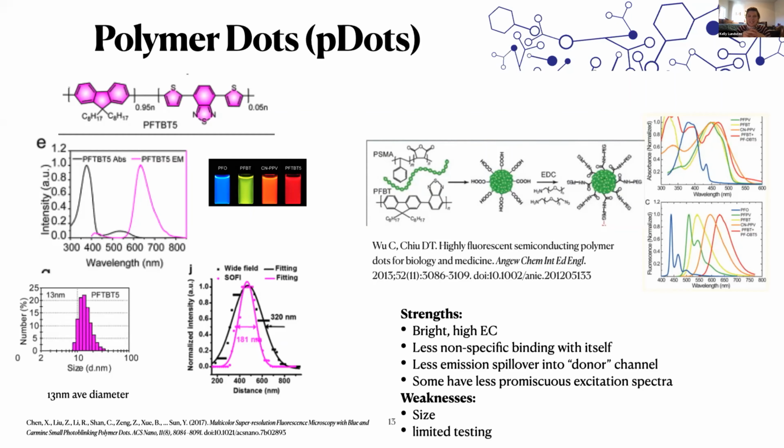But again, the weakness is going to be size. And right now it's just a limitation of testing. I would imagine they've got to be a little sticky. I don't know that for sure. I imagine they're going to have some penetration issues into thick tissue. Don't know it for sure. It's just all these question marks because there hasn't been enough testing in basic cellular applications yet.